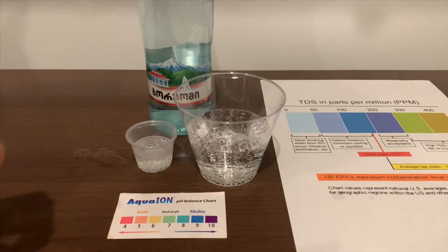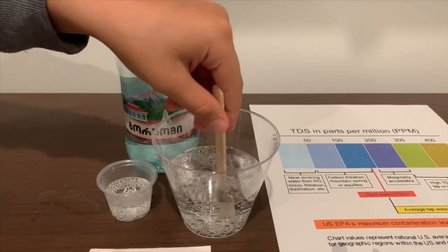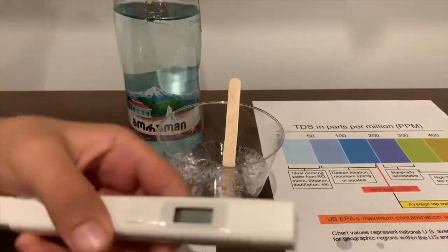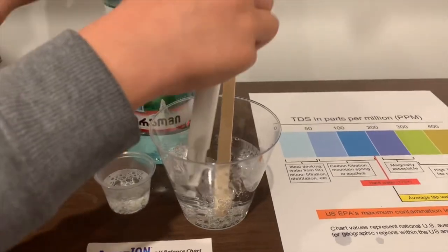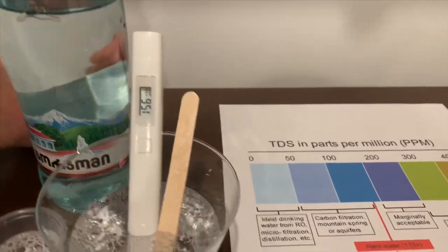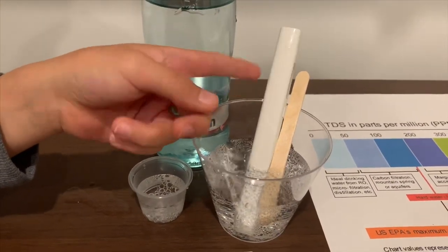First, we're going to test the TDS level. But first, let's stir it a little so we'll get a better result on the TDS. Turn on the TDS tester. Make sure it says zero and put it in. This is in the 100s — it is okay to drink. If you want to buy this TDS tester, the link is down below.